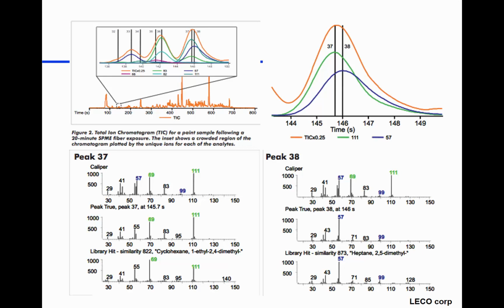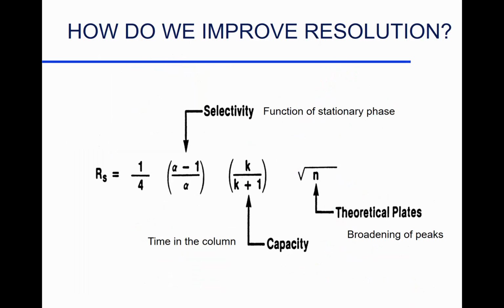And at one time, these instruments were, well, maybe half the length of the row here, about that much wider, and you'd have them this high. And now, of course, they're that big by that big. And instead of being an arm and a leg and more for this big monster, it's something you can afford. They get into the $50,000 to $80,000 range. That's affordable for what it does. So moving on, that's detectors. Tremendous sensitivity, tremendous specificity, and ability to improve resolution or separation.